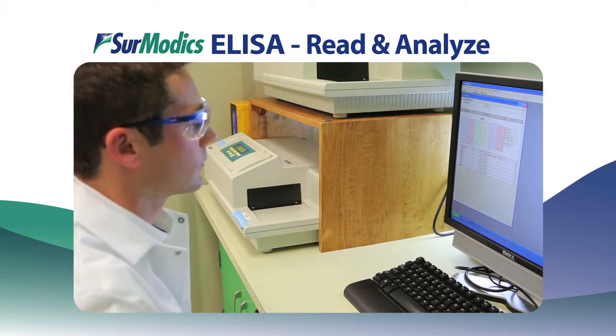Read the plate using a spectrophotometer capable of analyzing a 96-well plate. Print the data set and analyze your results.